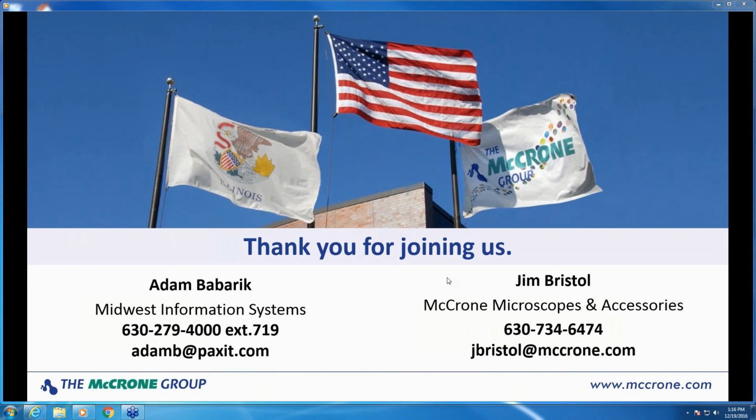All right, Jim. We've got a question here from somebody at a lab. Can the software integrate with Active Directory for accounting information? Yes, it can. User accounts that are created in PAXit, as we saw in the demonstration, as long as you type the domain name of that user before the username in Active Directory, it will sync up with your Windows account.